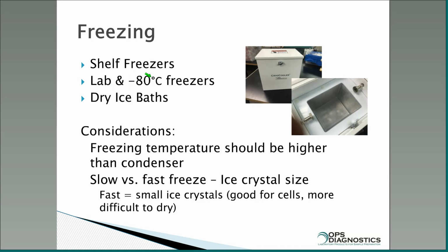And that idea of freezing on a slant or freezing by twirling the vial in the ice bath is important because of surface area. You want the maximum surface area to the volume of the material so that you can get the water out quickly and it doesn't have to go a far distance. If the water has to travel a far distance to get out of the ice, then you have a good chance that it will warm up and your whole sample will melt before it's dry. I'll show you some images on that in a second.